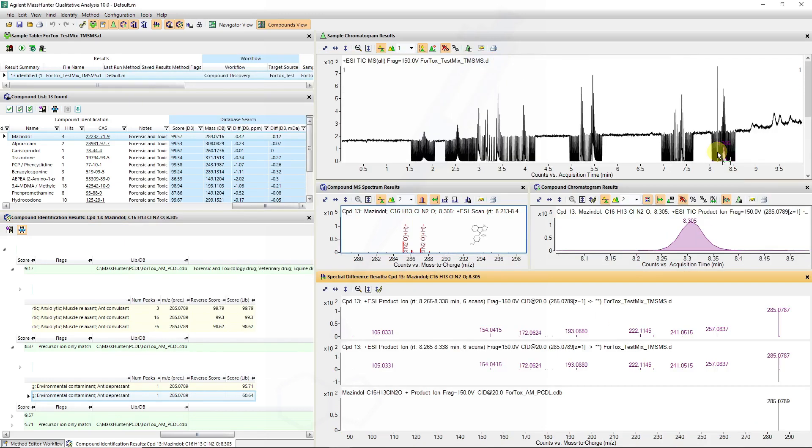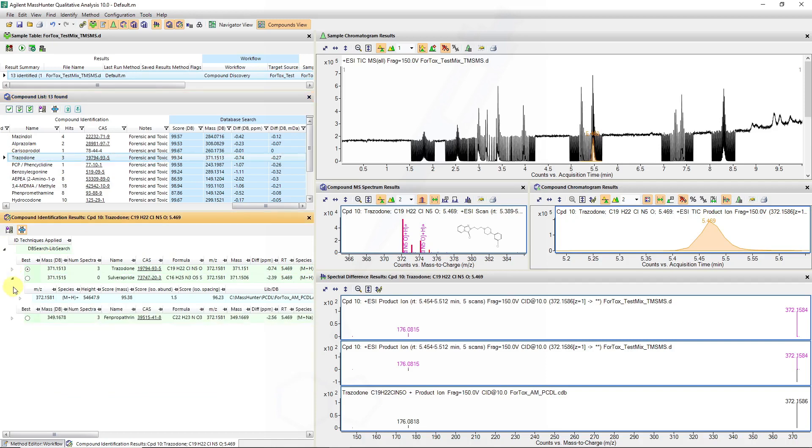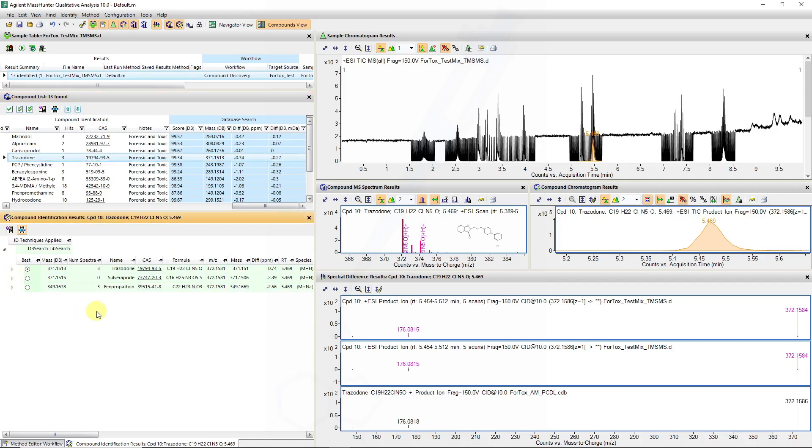So that's how we can gain confidence on identifying molecules based on their MS-MS in the compound discovery workflows. We can look at another entry, the trazodone, which is also part of a cluster of isomeric compounds which have the same mass but not the same formula necessarily.